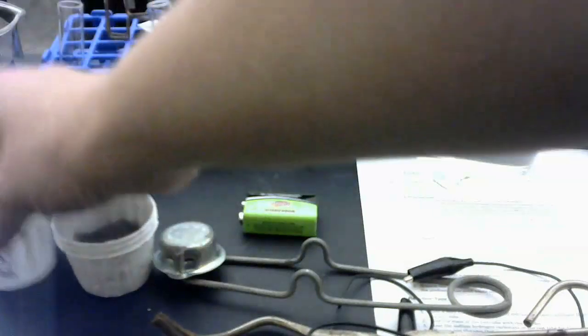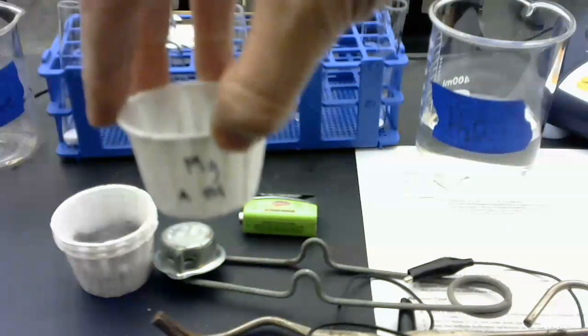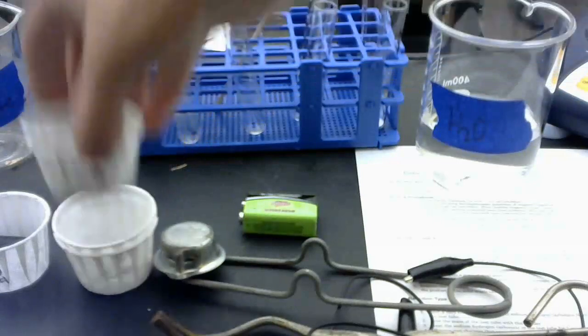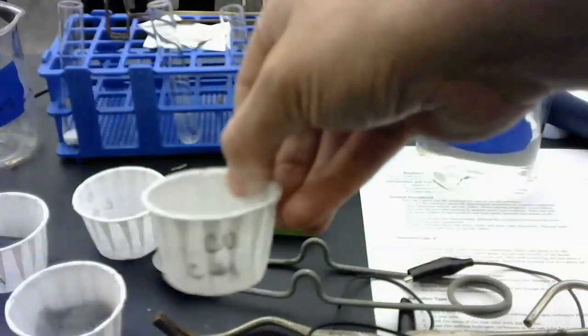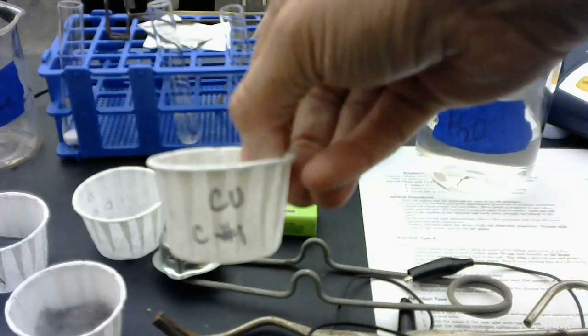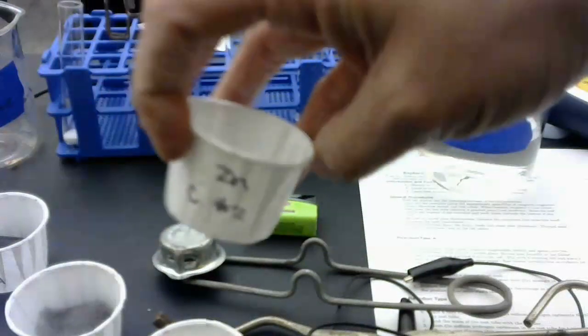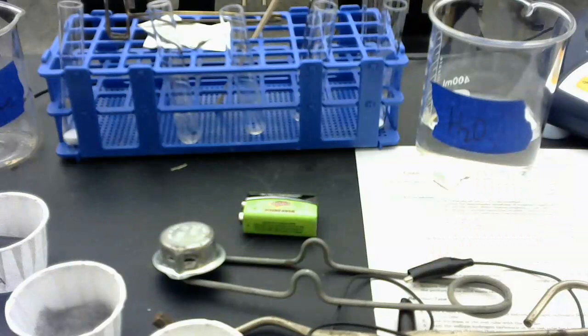So you're going to have magnesium, and it's labeled magnesium A1, and that means that it's reaction A number 1. And then you're going to have some iron, and iron is going to be labeled iron A number 2. Then you're going to have some copper. Copper is going to be labeled Cu, C number 1 for lab number 1. And finally, you're going to have Zn for zinc, C number 2. So those are the different materials that you're going to need for this entire lab. Okay, so let's get started.